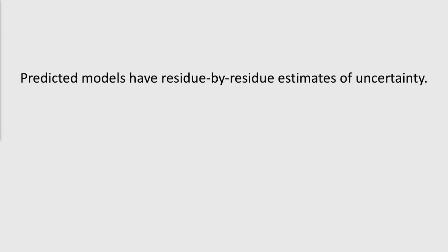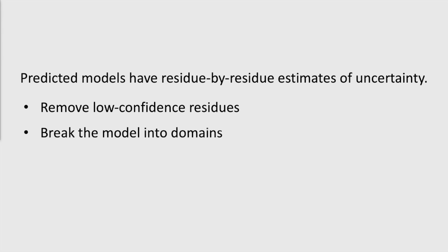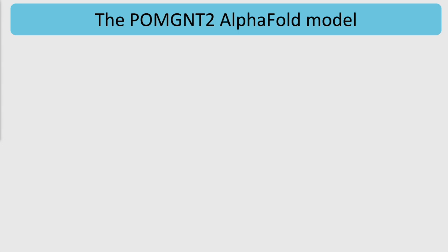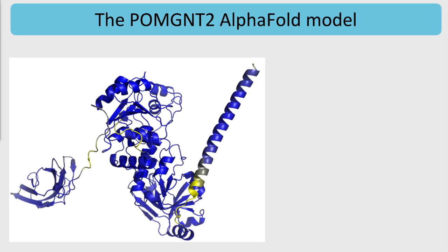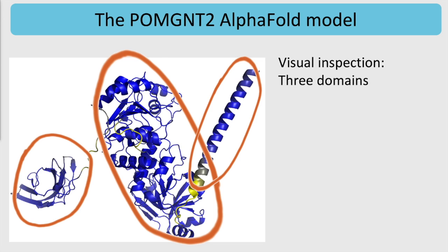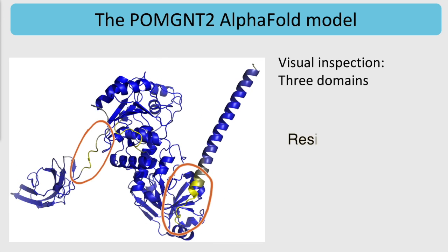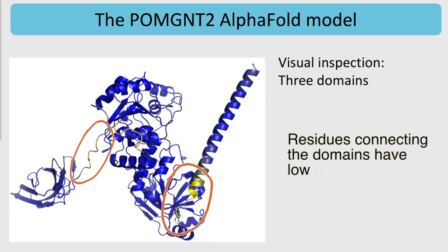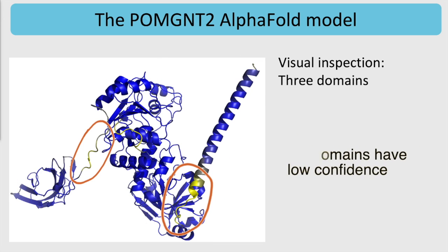Predicted models often come with residue-by-residue estimates of uncertainty. We can use this information to remove low-confidence residues and break the model into domains. Let's have a look at the AlphaFold model of POMGNT2. We can visually separate the structure into three domains. The yellow colors in the model tell us that the residues connecting the domains have low confidence.